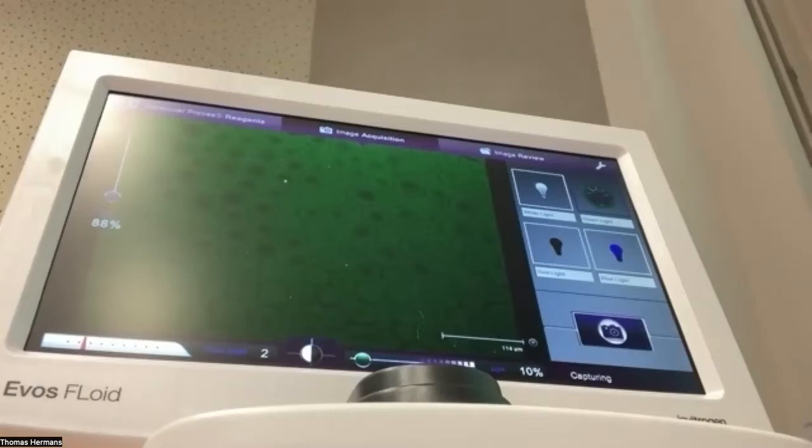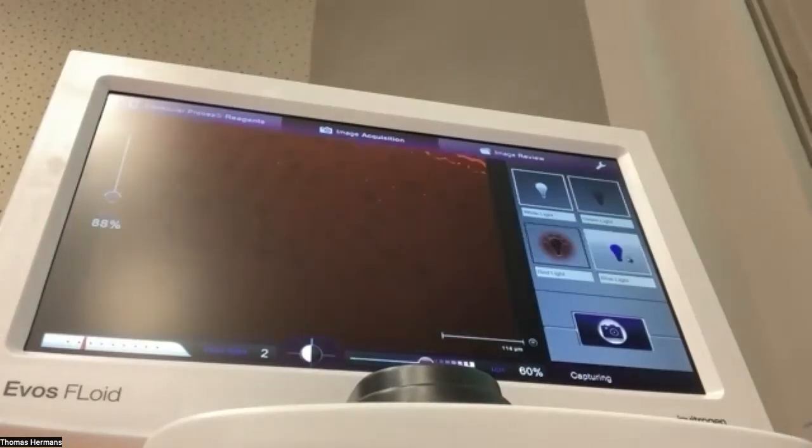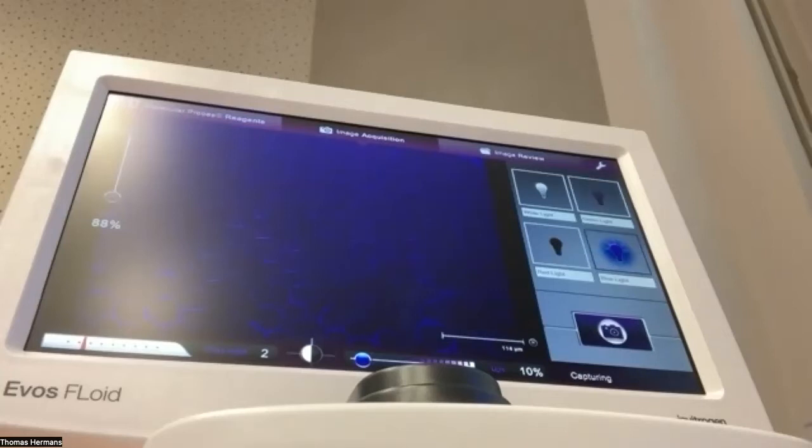Actually, plants and a lot of materials have what's called autofluorescence. It means that there are lots of different molecules and all of them very weakly fluoresce, so you can see them at different wavelengths. Okay, so this is green. I can switch to red. Okay, everything's red. And we can also go to blue. Everything goes blue. So this is a little bit boring because in autofluorescence, you see the same color everywhere.